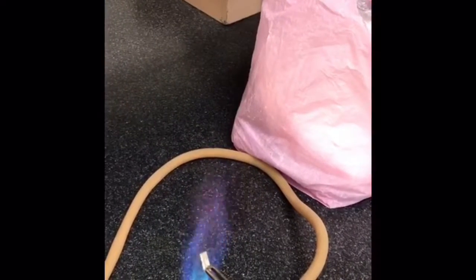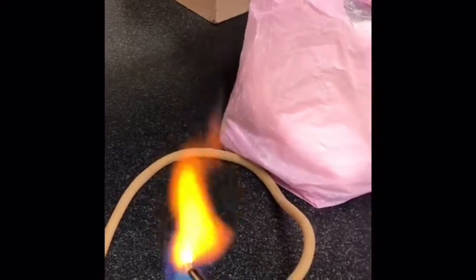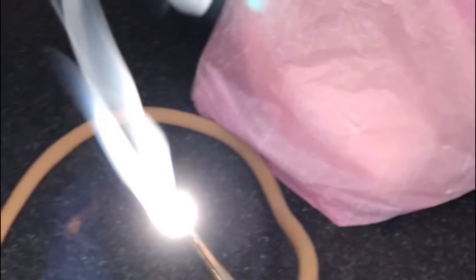When we burned the magnesium for the rapid oxidation, we could see that it burned very quickly. When it burned, it became a very shining light that hurts the side of the eyes. After burning, it became just white ashes.